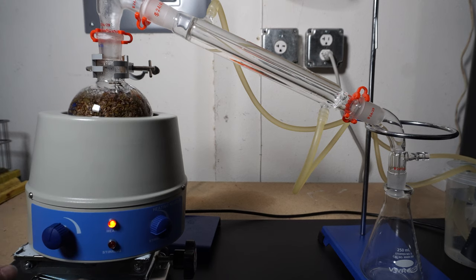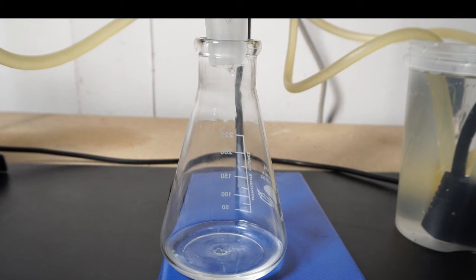Once the water is boiled nicely I turn down the heat slightly as not to damage the oils I am bringing over with high heat. Once I turn it down we can see I'm getting a pretty nice drip in my receiving flask.